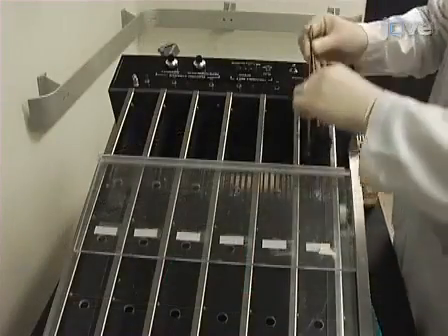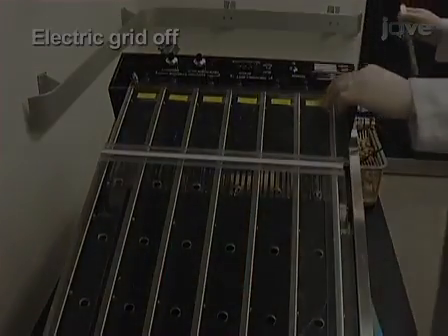Acclimate the mice by placing them onto the treadmill with the electric grid off and the belt drive motor.